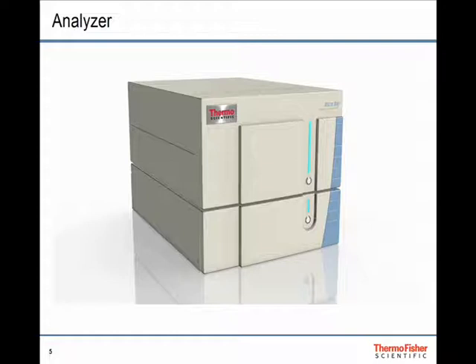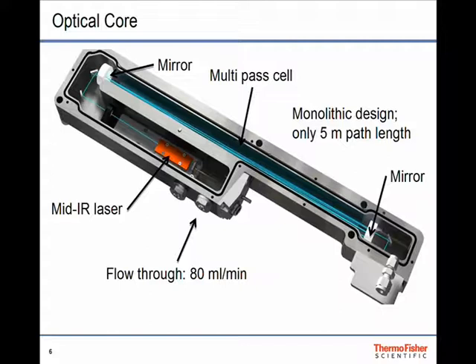Now let's look at the detection axis and the laser. The optical core where the analysis occurs is inside a temperature-controlled enclosure. Here you see inside the guts of the analyzer. Here is the laser head. We use what's called difference frequency generation—two near-infrared lasers and then a nonlinear crystal that converts the light to the mid-infrared. This is the mid-infrared laser head. You can see how the light is transferred to the multipass cell, where the laser beam bounces. It enters through a hole in the mirror and bounces back and forth about 13 times before it comes out of a hole in the back mirror and gets collected on a Mercury Cadmium Telluride mid-infrared light detector.